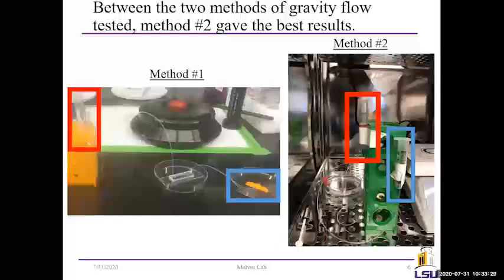Okay. And how much would that 100 microliters an hour be? So it's 2,400 microliters in a day. How much of the syringe is that? I can't do it in my head. Both of our syringes pictured hold 5 milliliters, but they were both filled with 4 milliliters. Okay. So a pretty good change in the head between the two over the 24-hour period. Yes. Okay.